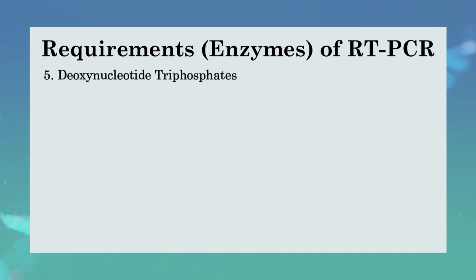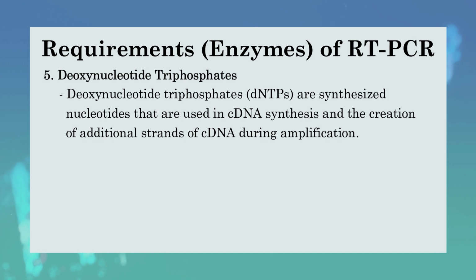Number 5. Deoxynucleotide triphosphates, dNTPs, are synthesized nucleotides that are used in cDNA synthesis and the creation of additional strands of cDNA during amplification.